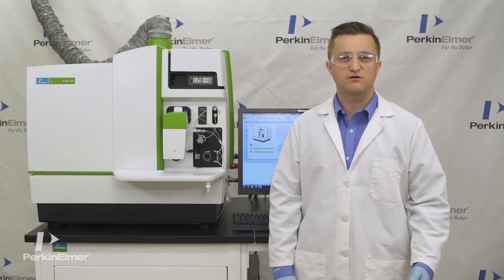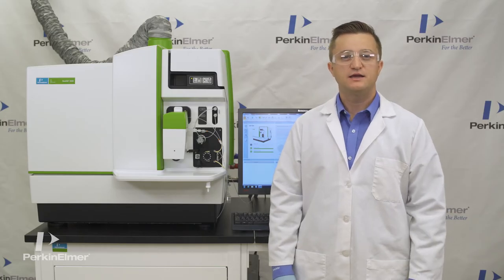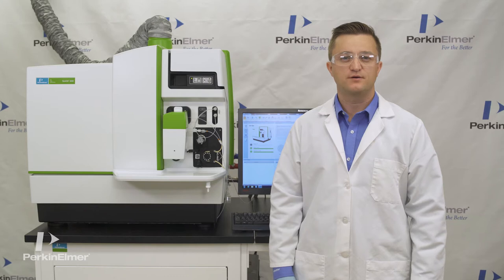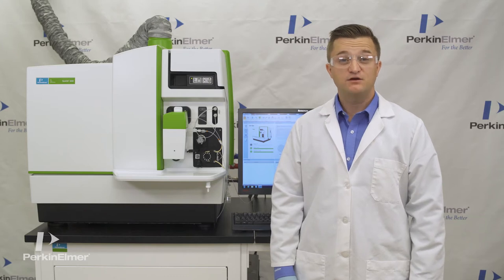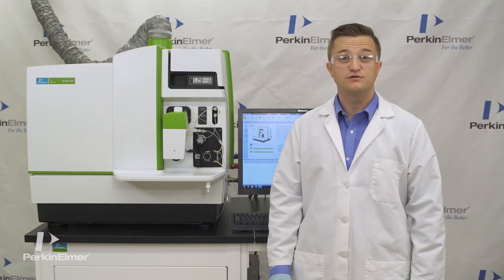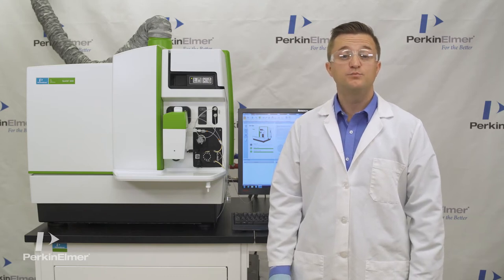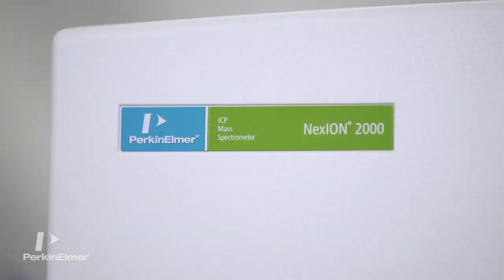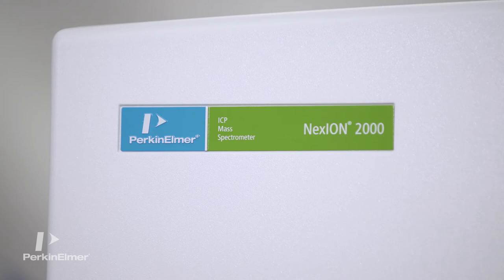Hello, my name is Aaron Heinemann, an inorganic product specialist for PerkinElmer. I'm here to introduce to you the new PerkinElmer Nexion 2000 ICP-MS.